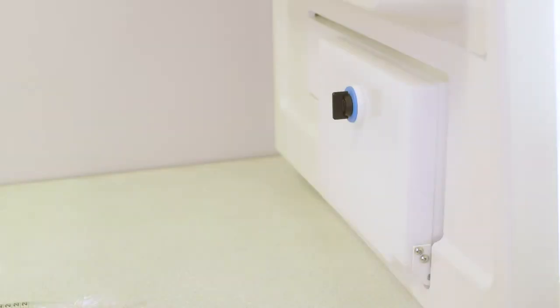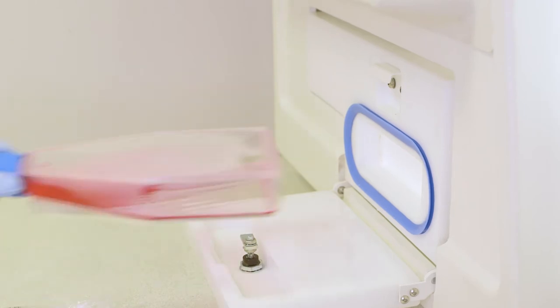Letterbox entry systems are also available, providing a straightforward way to quickly introduce individual items into the hypoxic station.